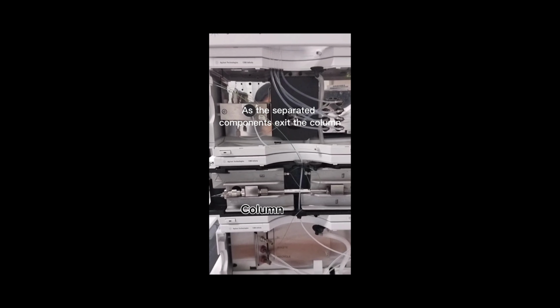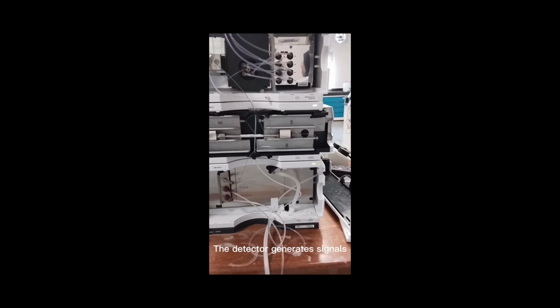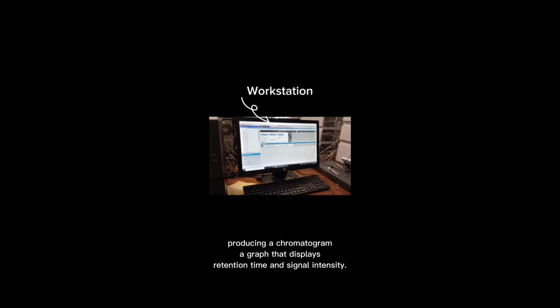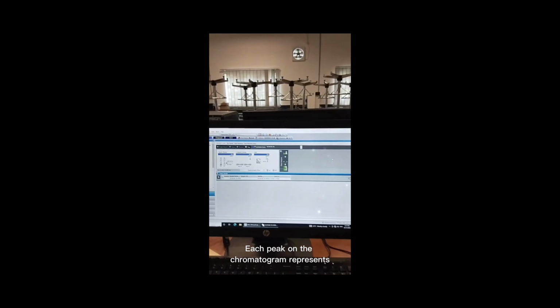As the separated components exit the column, they pass through a detector that measures specific properties such as UV absorption or refractive index. The detector generates signals corresponding to the concentration of each compound, producing a chromatogram, which is a graph that displays retention time and signal intensity. Each peak of the chromatogram represents a specific compound, allowing for its identification and quantification by comparing retention times with known standards.